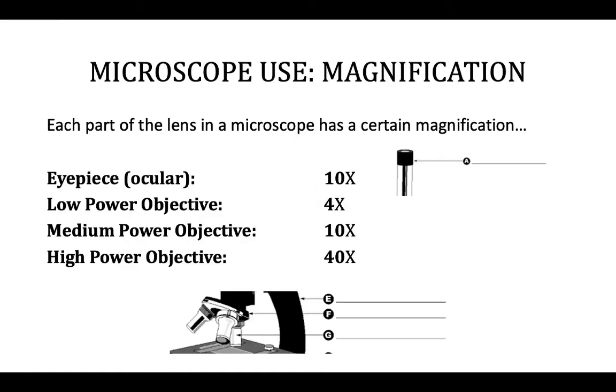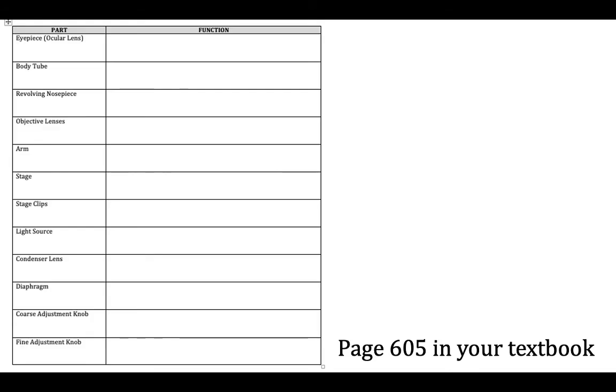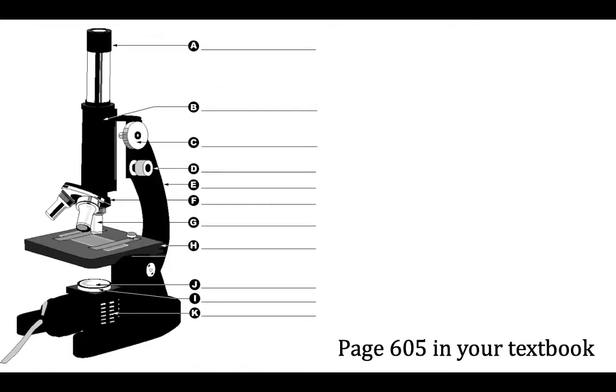This slide is the reason why I wanted to record over and talk through this lesson, and it's because of the magnification. Knowing the parts and the function only takes you so far. If you're using a microscope, you will have to use the different components of it. But I might ask you a question. For example, how zoomed in are you when you're looking at a microscope, right?